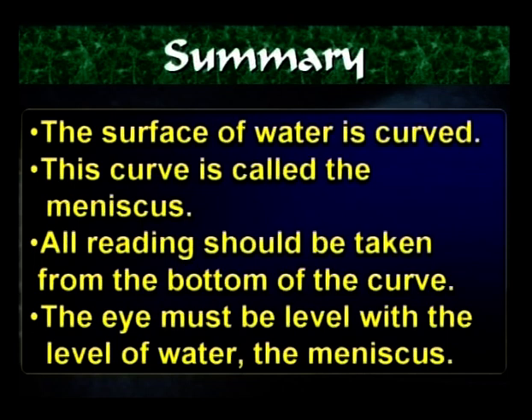Third point you need to remember is when you are reading, all readings should be taken from the bottom of the curve. The 4th point, the eye must be level with the level of the water, which is the meniscus.